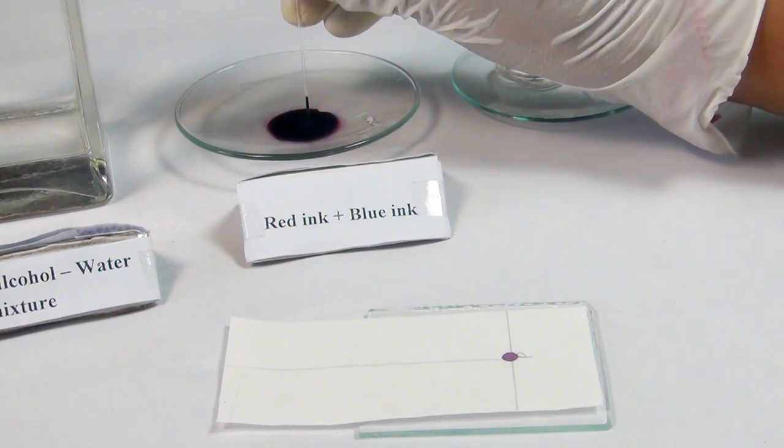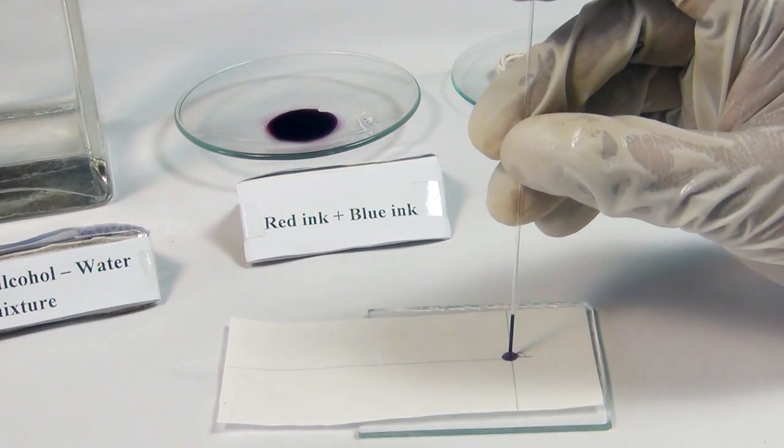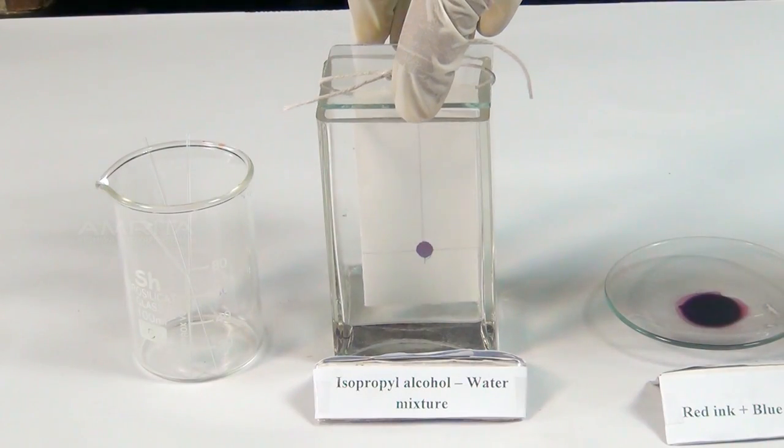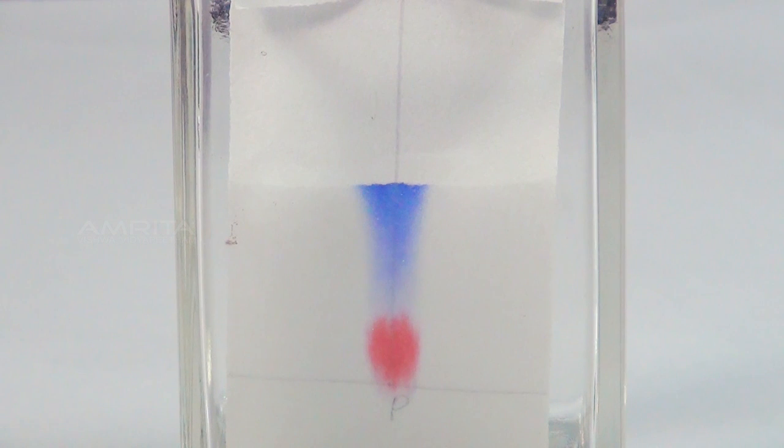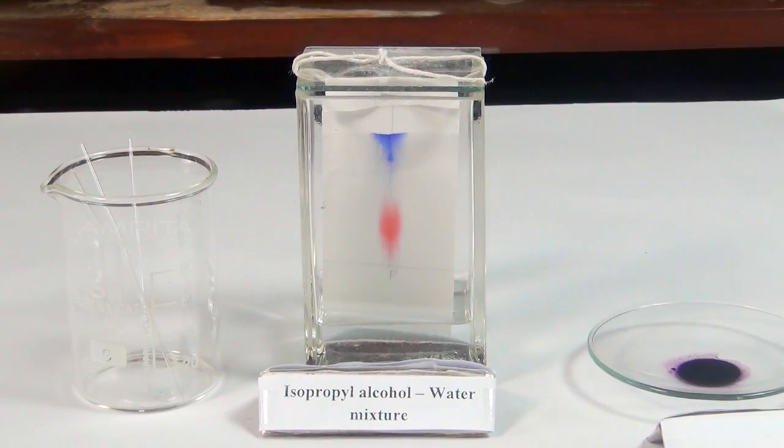In the paper chromatographic technique, the mixture of substances is applied onto a Whatman filter paper strip in what is called the stationary phase. A pure solvent or a mixture of solvents is allowed to move slowly over the stationary phase. This moving phase is called the mobile phase. When the mobile phase moves over the mixture on the stationary phase, the components of the mixture are gradually separated from one another.